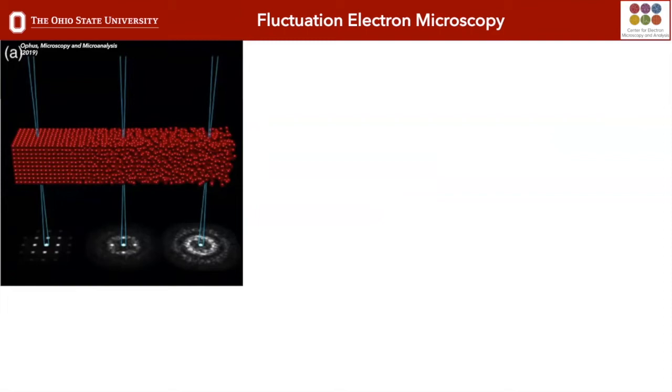In STEM mode, it allows you to vary the convergence angle. So in STEM mode, we can make our convergence angle what we want it to be. You're not geometrically limited by the apertures in your system. So as you do analytical work, you'll know that's an extremely important parameter. And optically, you can go to a smaller aperture and then use the C3 lens to virtually increase your convergence angle such that you have this improved energy resolution or whatever you need while having a larger convergence angle.